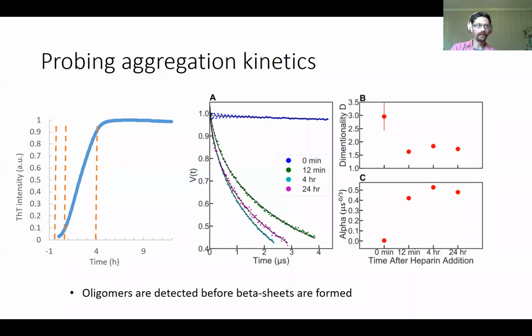So what I did there is I quantitatively simulated, so to say, mathematically calculated, a mixture of 1D and 3D at every 5% from 0 to 100%, so I can see how the shape differs. So the short answer is yes, we have a mixture here.